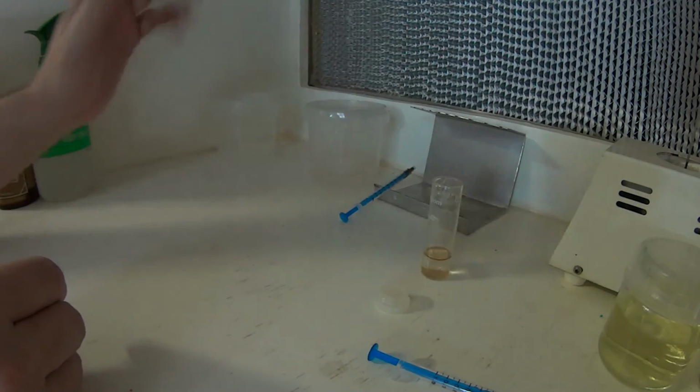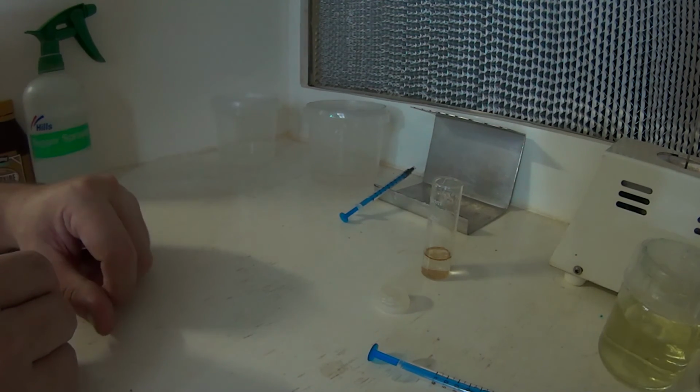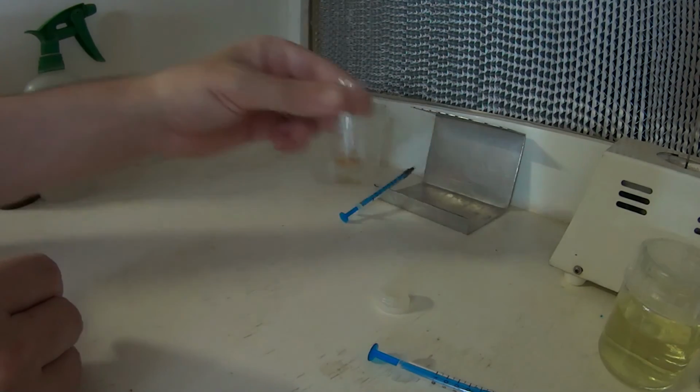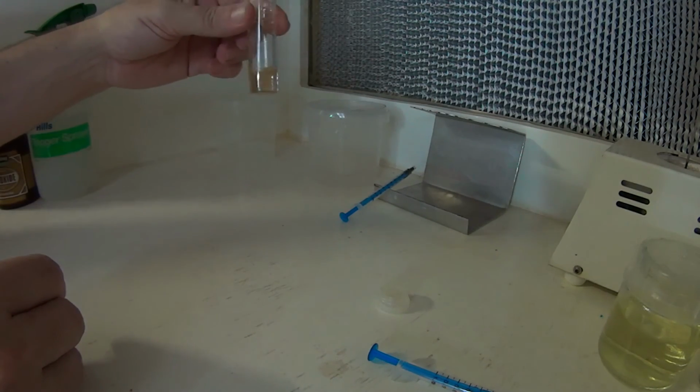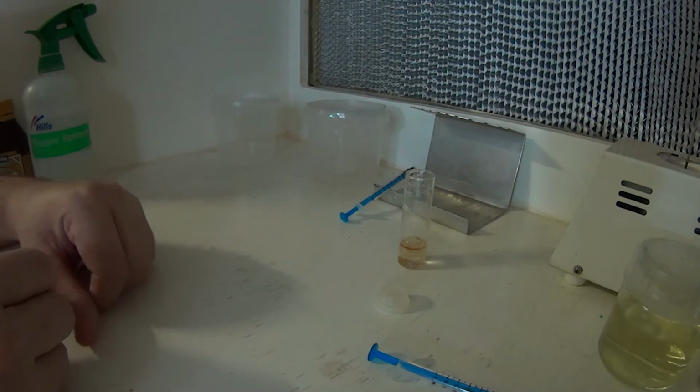and just continue on with the process until you fill all your containers now. I've only used the two here, but with that amount of seed, you could probably get four or five containers, but for today, I'm just going to put it into two.